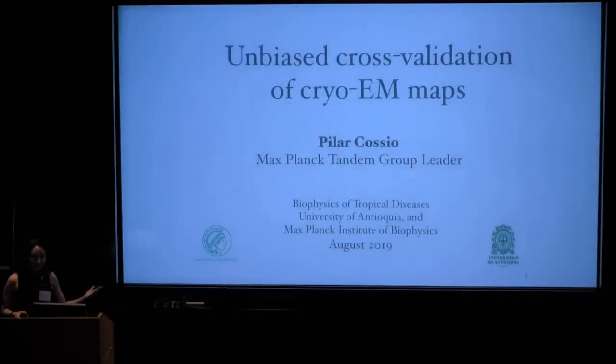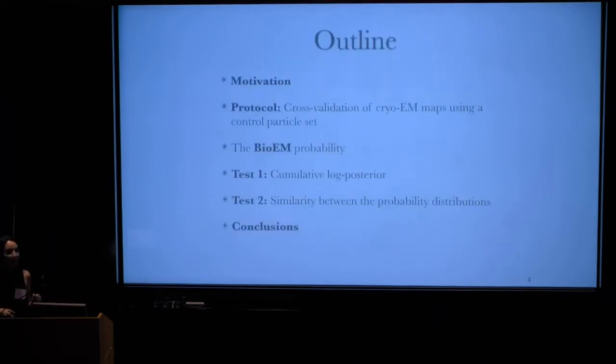So the title of my talk is an unbiased cross-validation of cryo-EM maps. I'm going to start with the motivation of our work, why it's important to validate cryo-EM maps, the reasons behind it. Then I'm going to explain the protocol and the main idea of our work, which is to use an independent cross-validation set, a control validation set that is not going to be used in the refinement, for validating the cryo-EM maps.